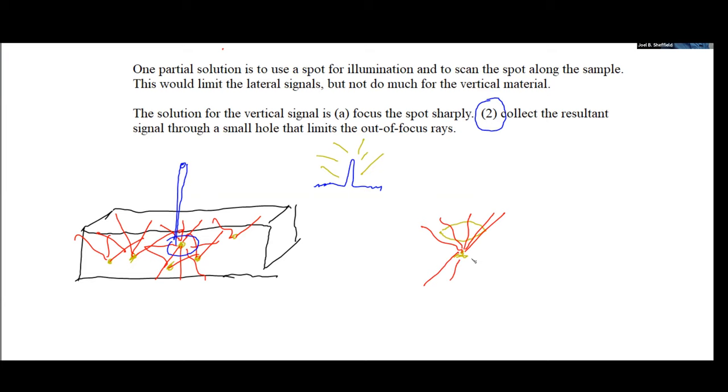Now, here's the trick. How did I get a spot? Oh, I got a spot by focusing my light through a hole, through this hole. We call it a pinhole. Okay, so the light has come down through that pinhole, and my color codes are really going to drive everyone nuts. But okay, so I've got light coming down here through the pinhole, and I'm looking at one specific spot on my sample. It's got to go through the lens. All right, and I'm going to move it back and forth, but wherever it hits the sample, I'm getting light going out in all directions.